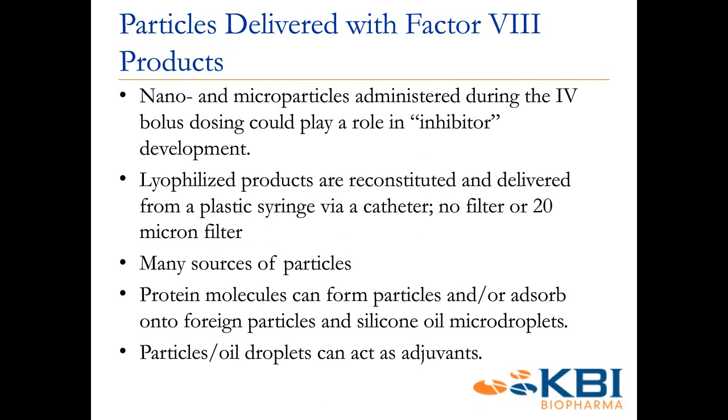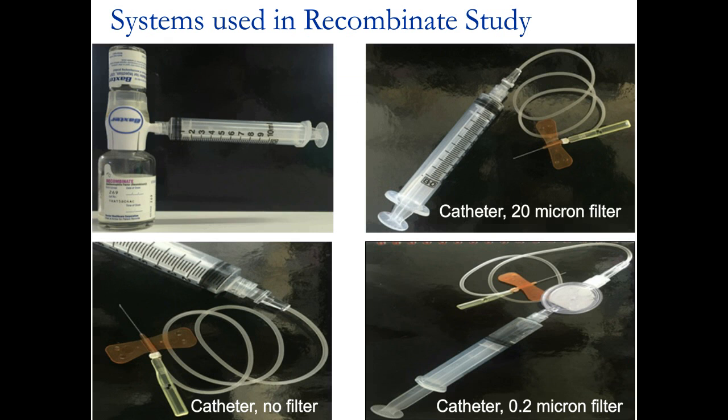So there could be quite a bit of particles, looking at those images of the different materials involved in the administration. Particles could certainly come from a lot of different surfaces involved in the administration. Certainly there are a lot of places where we could imagine a protein could degrade, either seeing these different surfaces or just from the stress of the actual reconstitution and administration. So this is something we wanted to characterize, and mimic a type of infusion with this product.